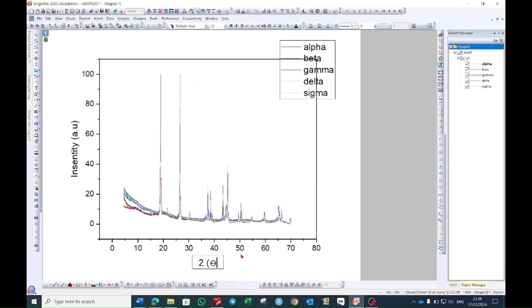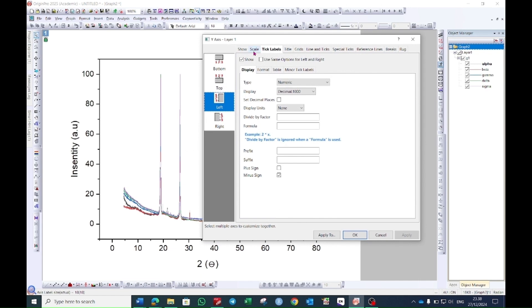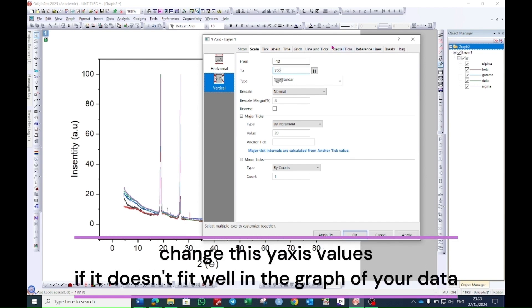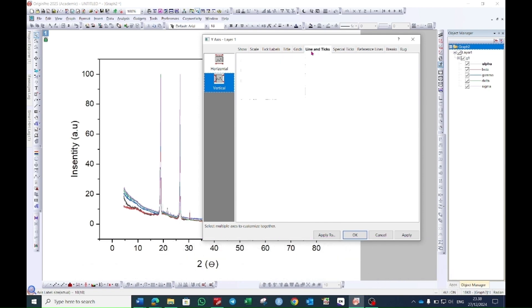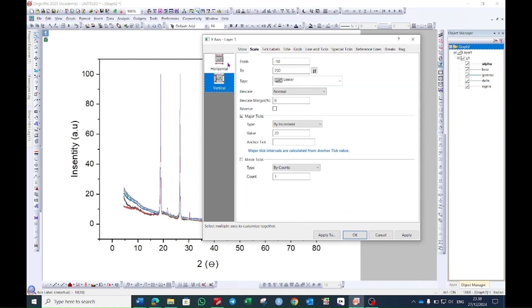Close this window and close the bracket. Now select the Y-axis and double-click on it — a window will open. Go to the 'Scale' option; in the vertical, choose from minus 10 to 700 (you can choose as per your data). Then go to the 'Line and Ticks' option and choose 'Major Ticks' as None, and similarly 'Minor Ticks' as None.